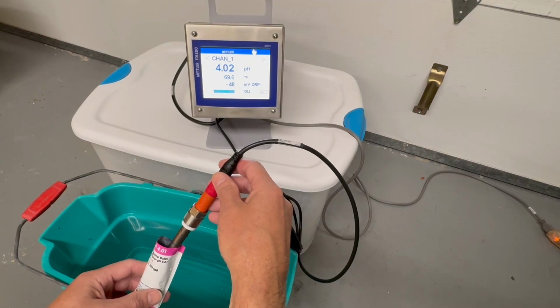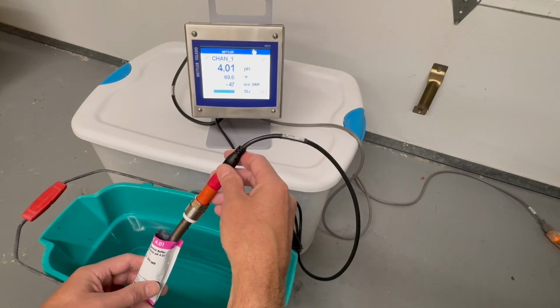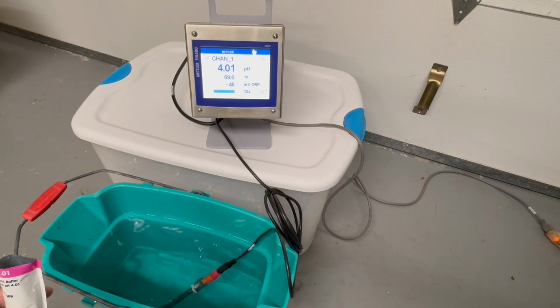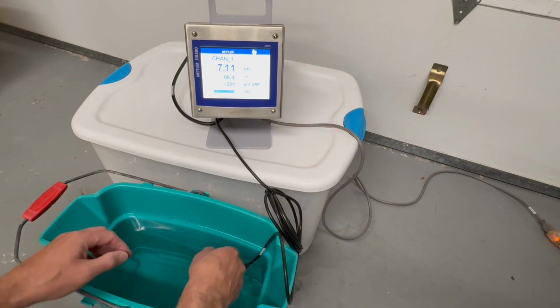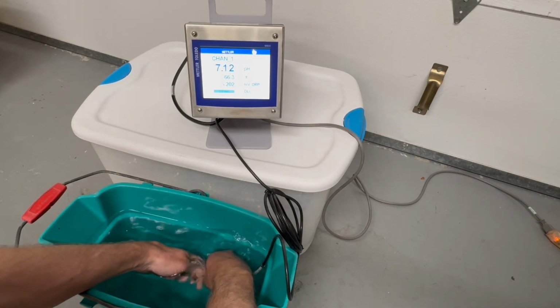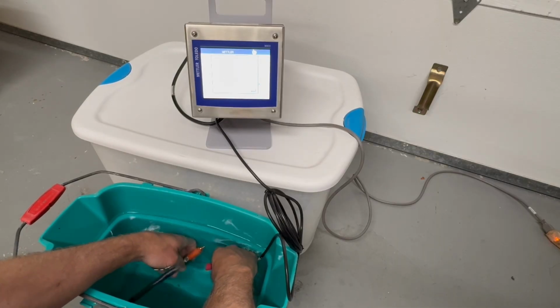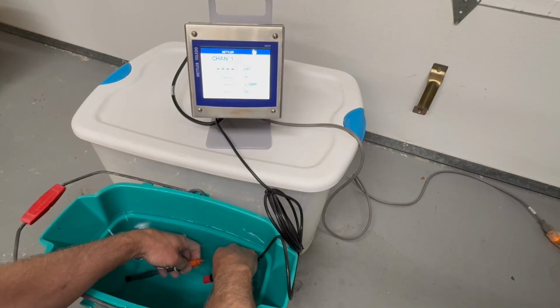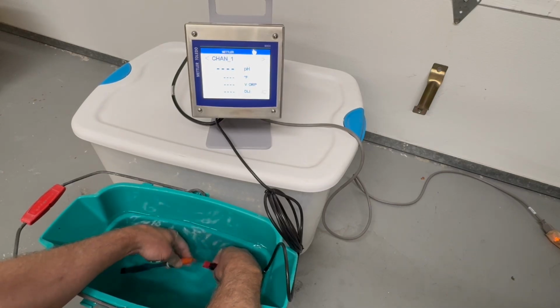To demonstrate this signal integrity and data reliability, we've got a pH probe sitting in pH buffer 4. We're going to let that drop into a bucket of tap water and let the sensor equilibrate over time. It reaches roughly a low 7 pH value. Then we're going to disconnect this probe and show that once the sensor is disconnected from the transmitter, the handshake that we saw in an earlier video, the transmitter recognizes there's no sensor, and eventually it gives dashes, which suggests that there's no data input to that transmitter.